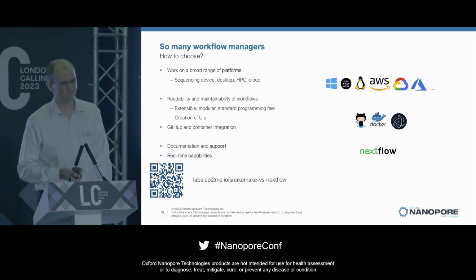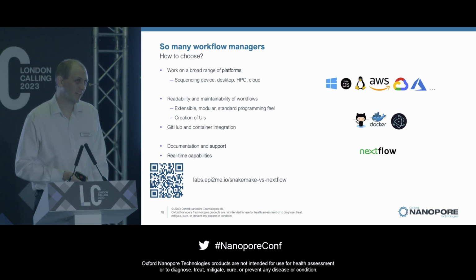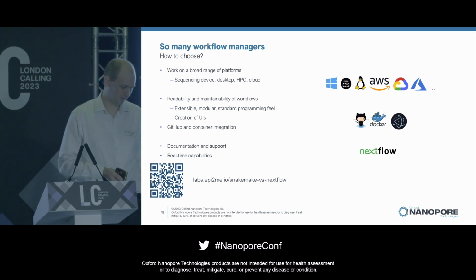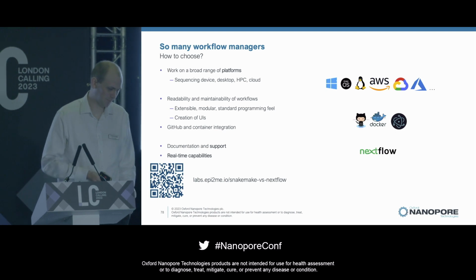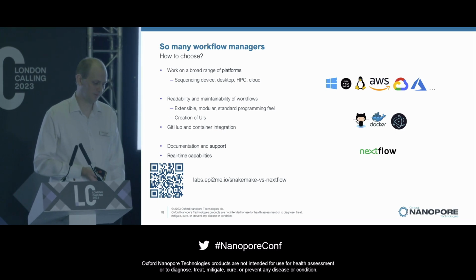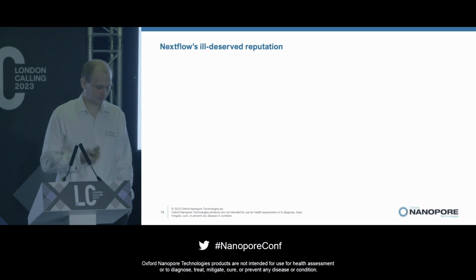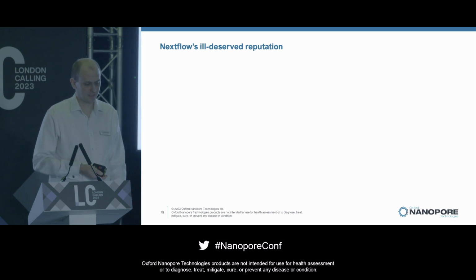Now, for a lot of things, like assembly, you're not going to do assembly in real time. You need all of the data there. I did demo something eight years ago at London Calling, where I was trying to do assembly in real time. It kind of works. You need to get some data, but I would stick to not doing those things in real time. But there are things we can do in real time. I'll come back to an example of that.